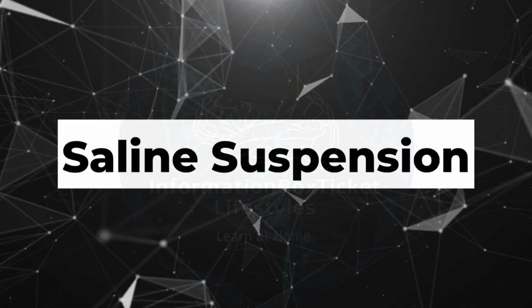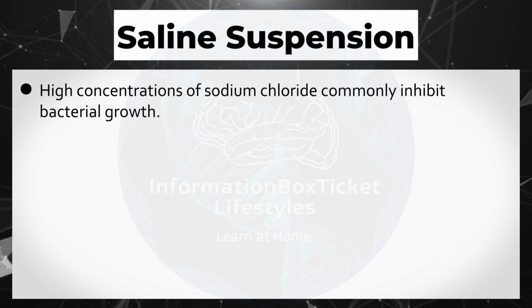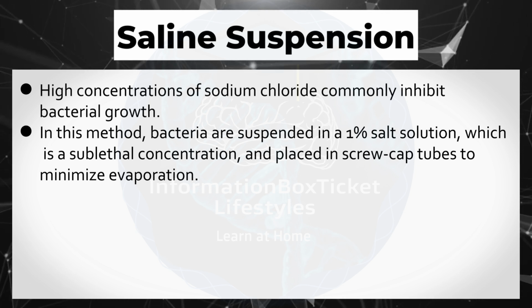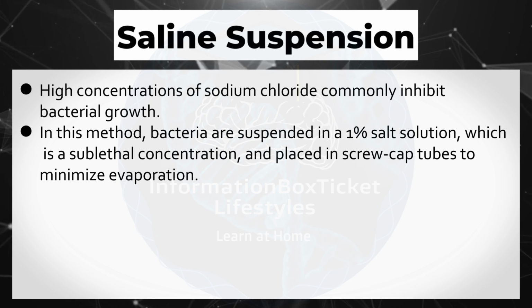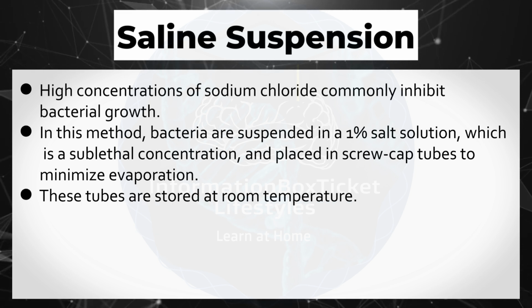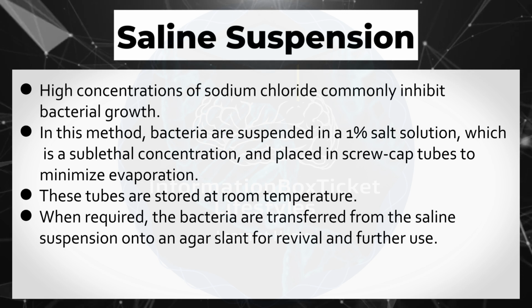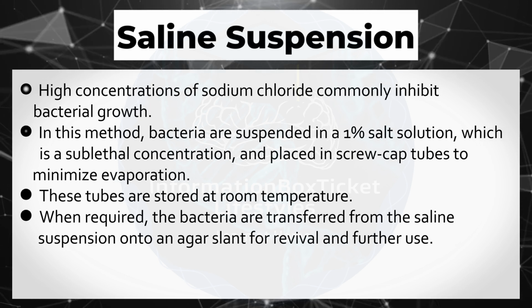Saline suspension. High concentrations of sodium chloride commonly inhibit bacterial growth. In this method, bacteria are suspended in a 1% salt solution, which is a sublethal concentration, and placed in screw cap tubes to minimize evaporation. These tubes are stored at room temperature. When required, the bacteria are transferred from the saline suspension onto an agar slant for revival and further use.